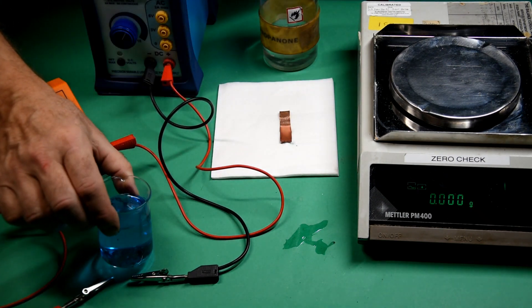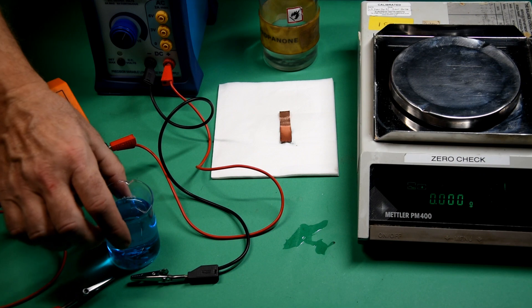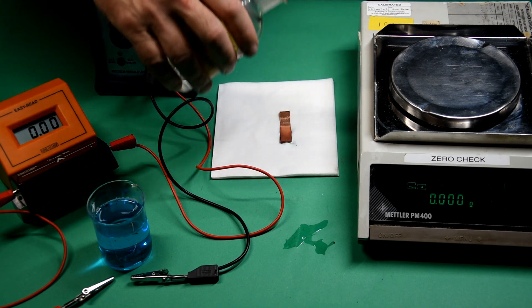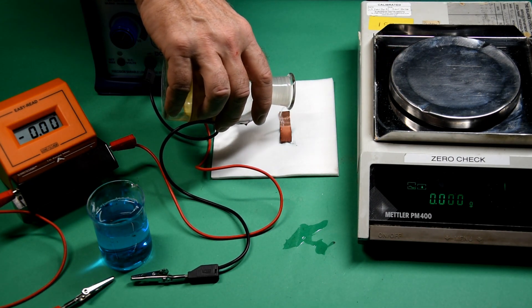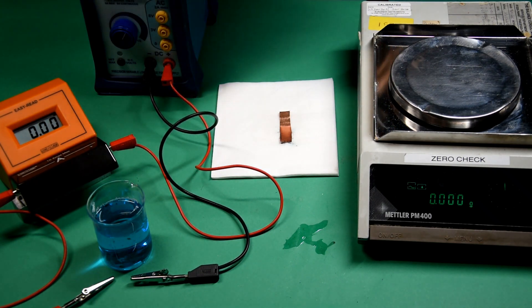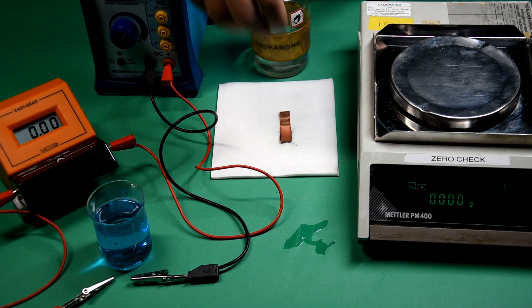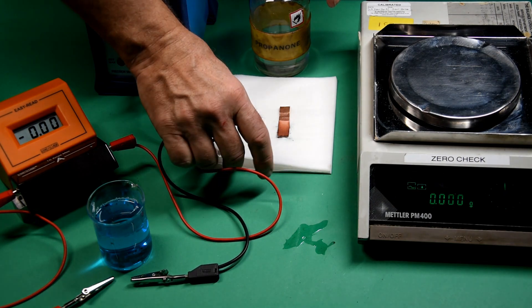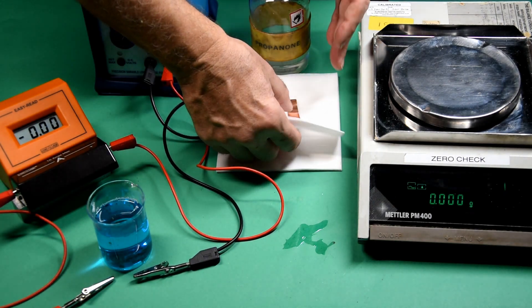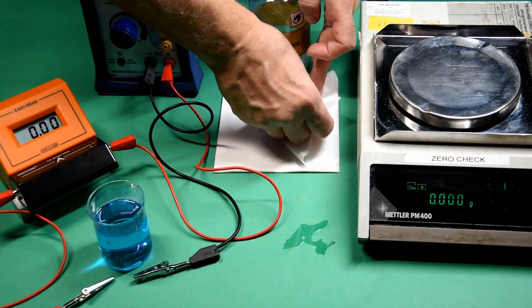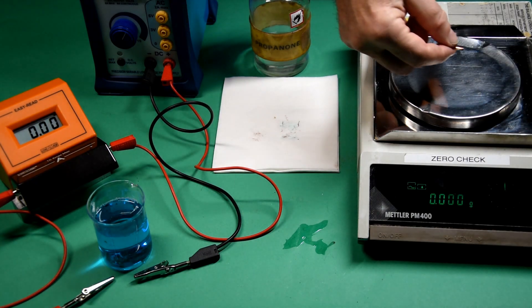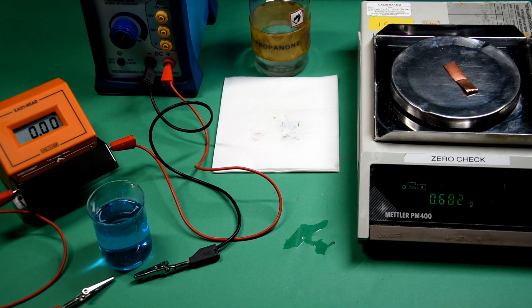The process is repeated for the cathode. Once again, waiting for it to dry before putting it on the top pan balance. The cathode has gained approximately 0.13 of a gram.